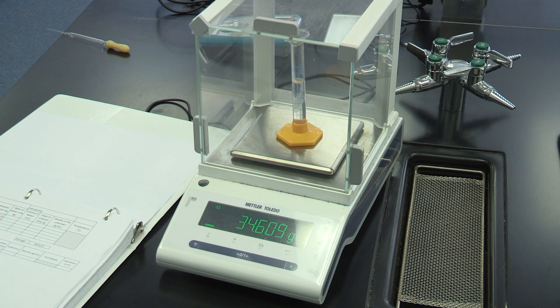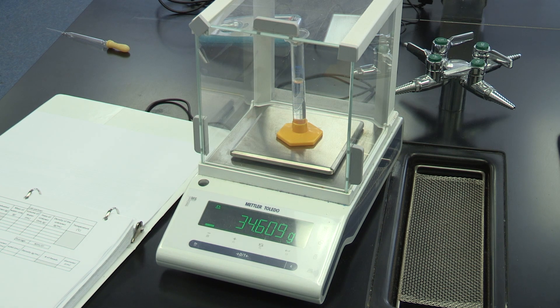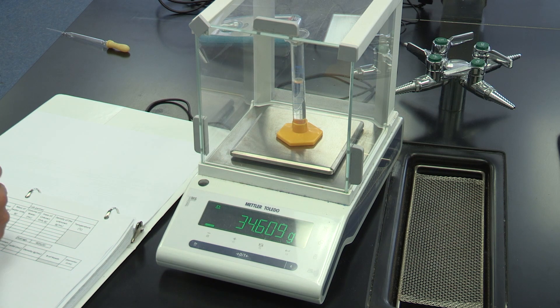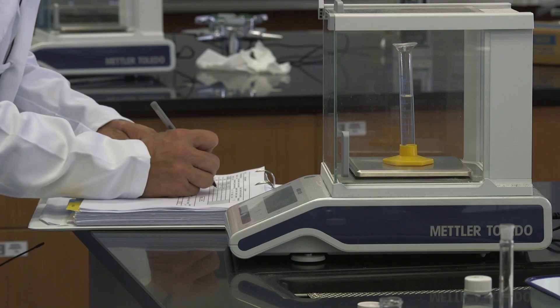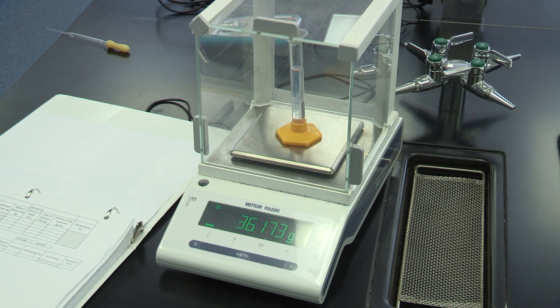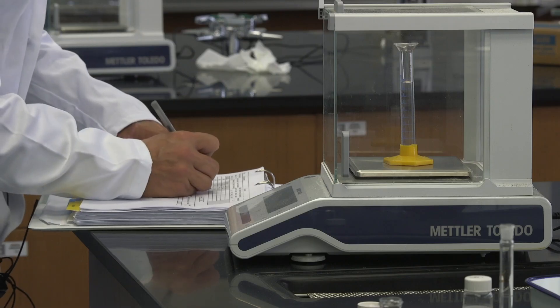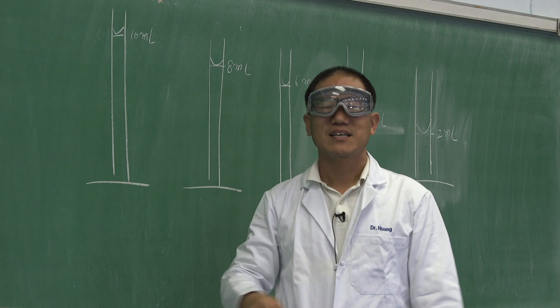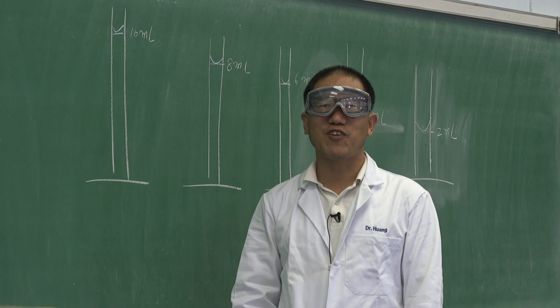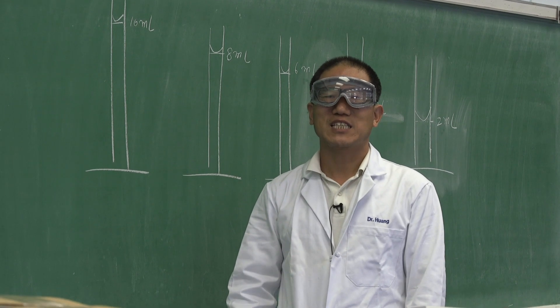With unknown liquid at 10 milliliter mark, the mass is 36.173 grams. Then, this will be the end of the first part of experiment 1.